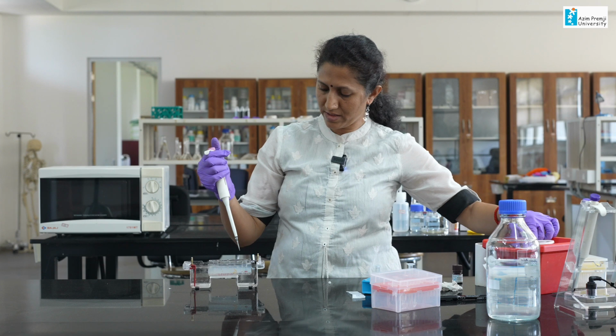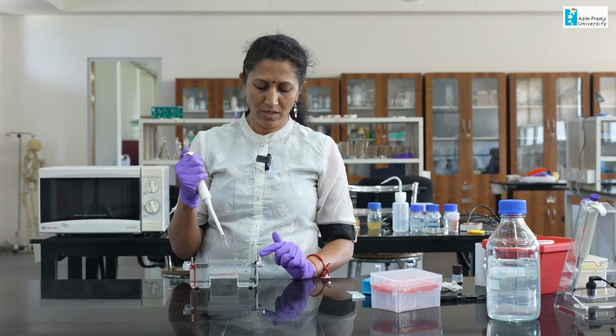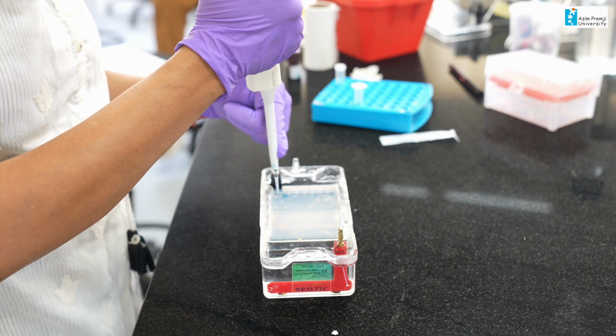So, for this, as I mentioned before, I used 2 primers. These are the primers for the bacterial 16S rRNA gene. They usually amplify a stretch of DNA which is approximately around 1400 base pairs. I am going to load the DNA ladder here in the first well.